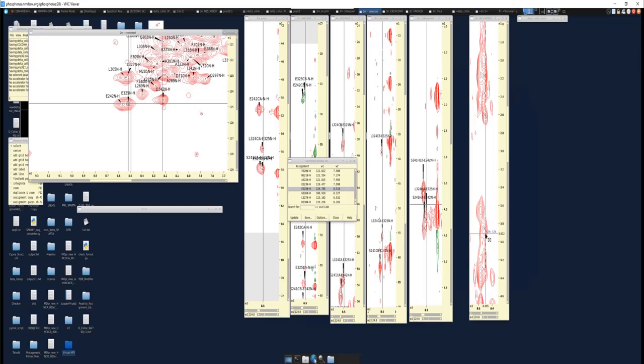So the NOESY is really nice for assisting in assignment by basically confirming all the other data you have. I would never use the NOESY by itself because, again, it can be a little risky because it's anything in space. It doesn't necessarily mean your I-1 or I+1 neighbors. Sometimes I've had cases where I don't see the I-1 or I+1 neighbors. I see a NOESY that's nearby at another part of the protein. So I would never use this by itself, but I think in conjunction with all the other experiments you have, it's a very useful experiment.